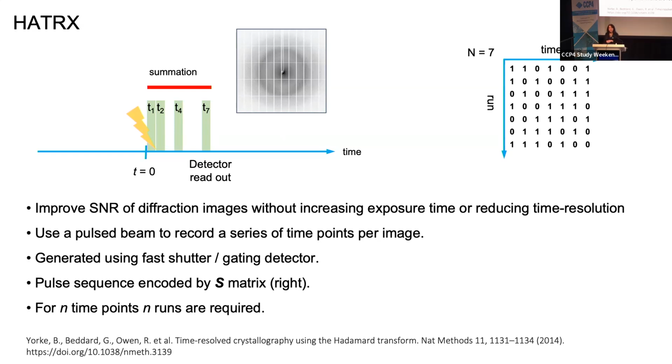So when I started doing these methods developments, I was trying to look at photo-caged ligands inside enzymes, and it turns out that's quite challenging. Photo-caged ligands don't always play nice, they don't always bind well, the occupancy is often low, and we can struggle to really understand what we're seeing in our data from a novel technique. So to develop new methods, I wanted to find a protein that was amenable to photoactivation on appropriate timescales for the methods that I was developing.